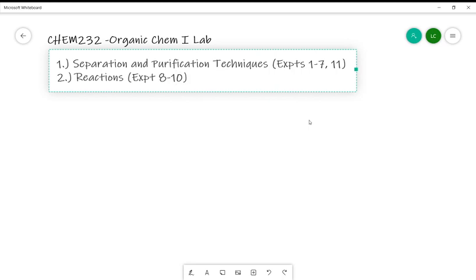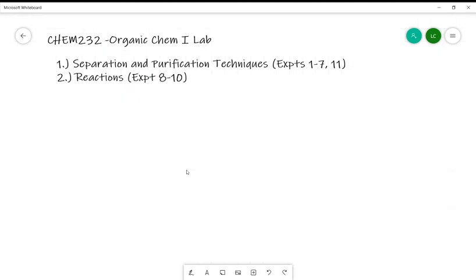You do the free radical halogenation reaction, nucleophilic substitution reactions, and you also do elimination reactions with your reflux. So the goal of this video and the videos to come is I'll just focus on the first bullet that I have, separation and purification techniques. This is my first time making a video, so I might be kind of slow.